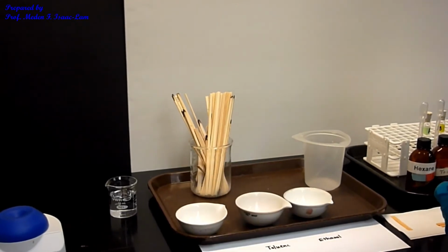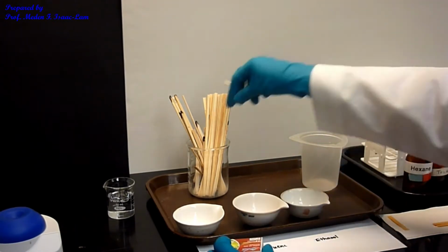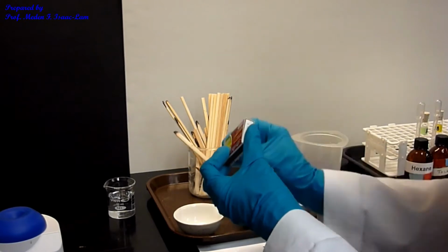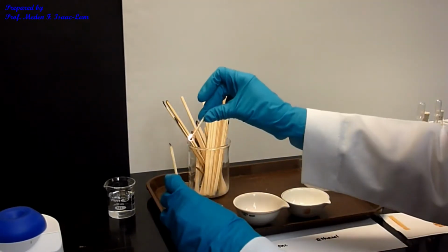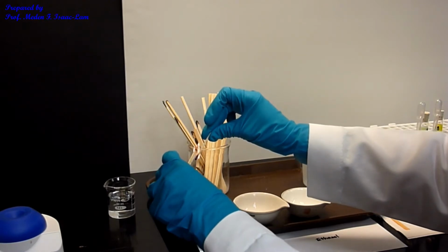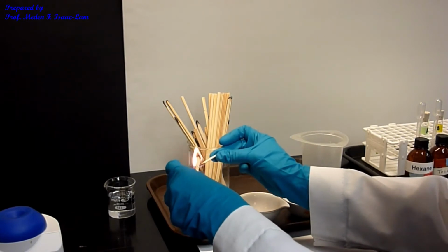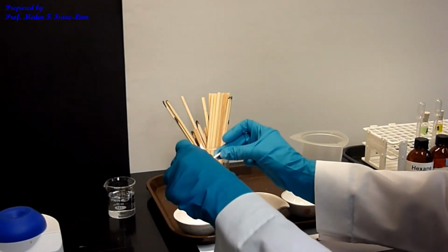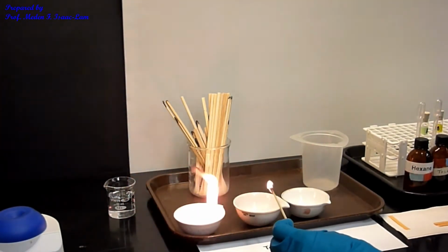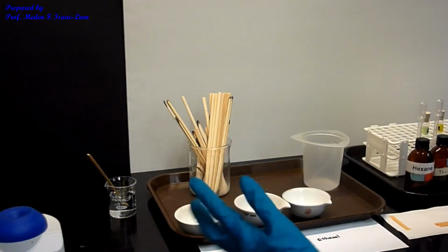So I'm gonna do the combustion. So I have the match in here. So I have all of these that we had before. Okay, so see the flame. So that was the hexane sample.